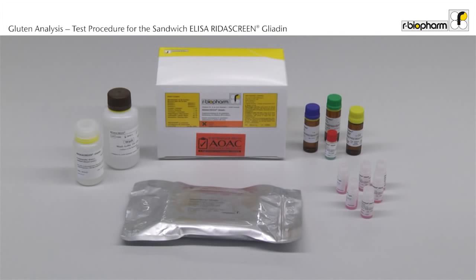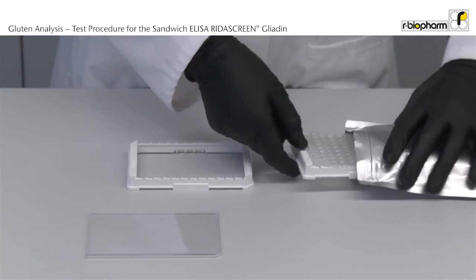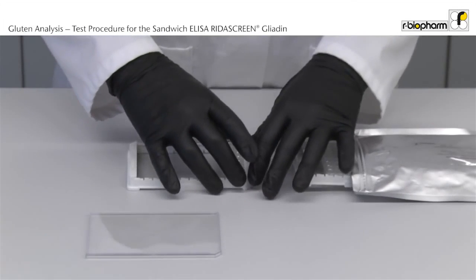RIDAS Green Gliadin contains all reagents to carry out the test procedure. Unpack the bottles and the microwell plate from the box to bring all reagents to room temperature before use. This takes about 60 minutes. After an hour, open the aluminum bag and insert a sufficient number of strips into the microwell holder.